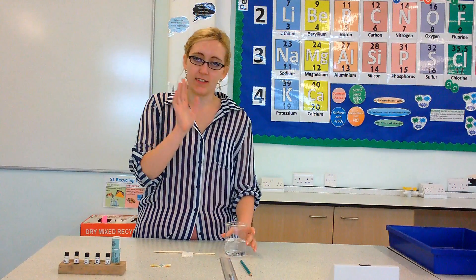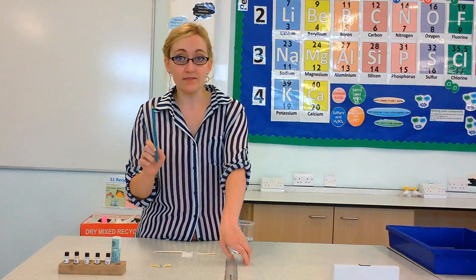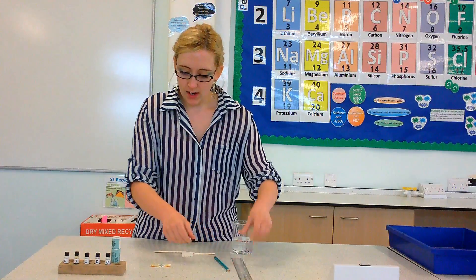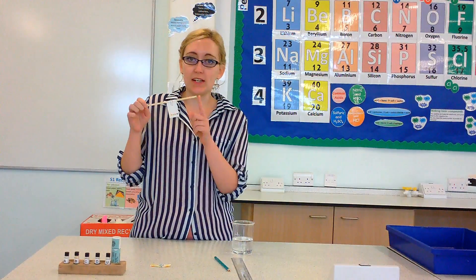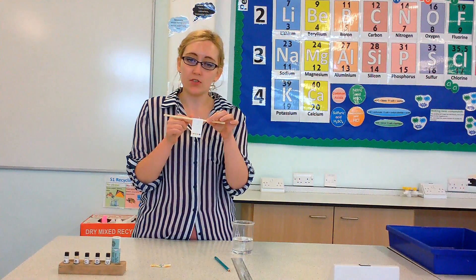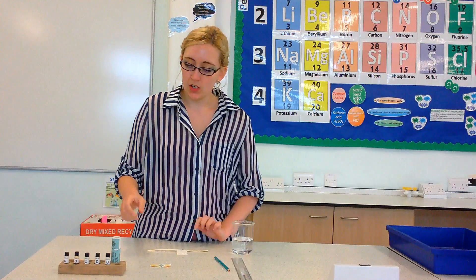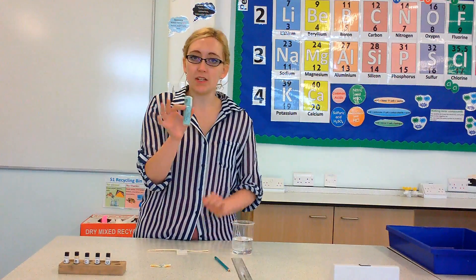What you're going to need for this practical is a beaker with some water in it. You're going to need a very sharp pencil and a ruler. You're going to need a splint. On my splint I already have a piece of filter paper which has been cut into a rectangle. You're also going to need some capillary tubes.